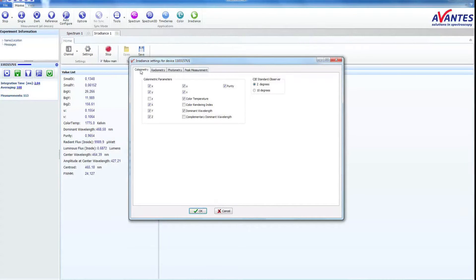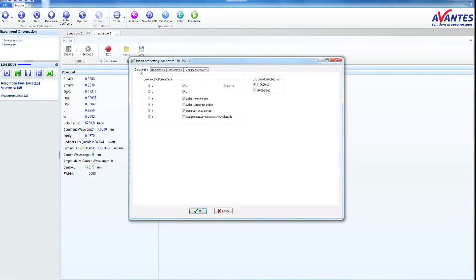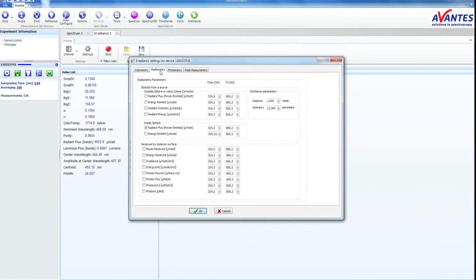In these four tabs, you can select your parameters of choice. Select the desired color parameters.